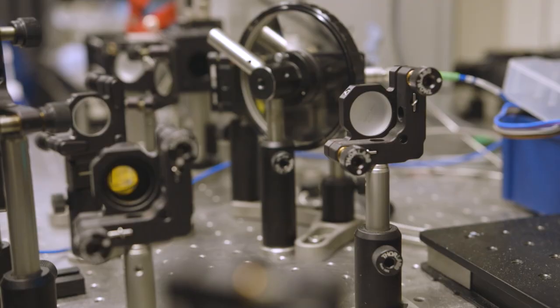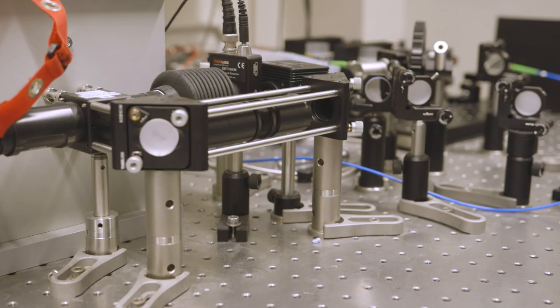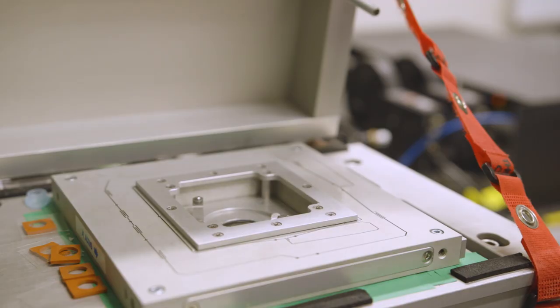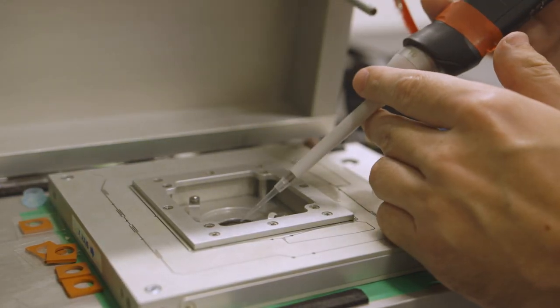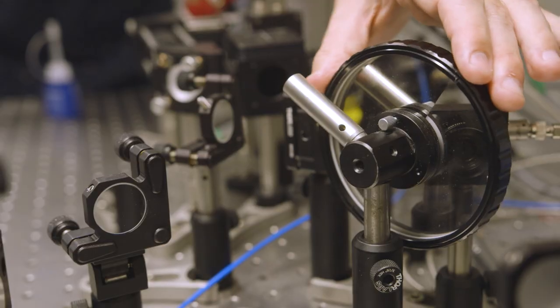And with this technology now cheaper and more accessible than ever, it could have huge impacts in medicine and beyond. So we've got a lot of collaborative work with other labs in Sheffield and around the world looking at proteins and DNA systems.